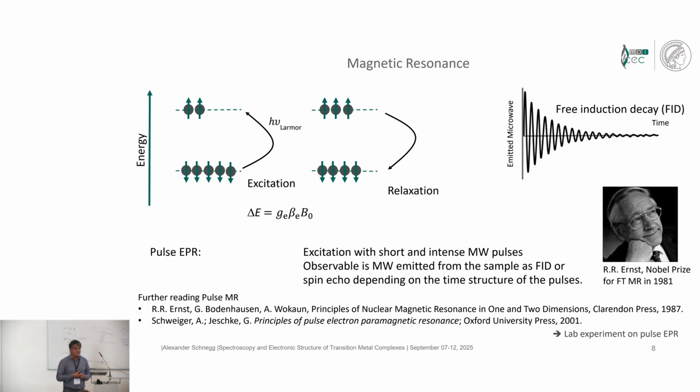It's benefiting from an effect which is called the multiplex effect, and the employment of all the possibilities which you get from a free induction decay was shown by Richard Ernst, who received the Nobel Prize for employing free induction decays and echoes and pulse NMR in its full width.